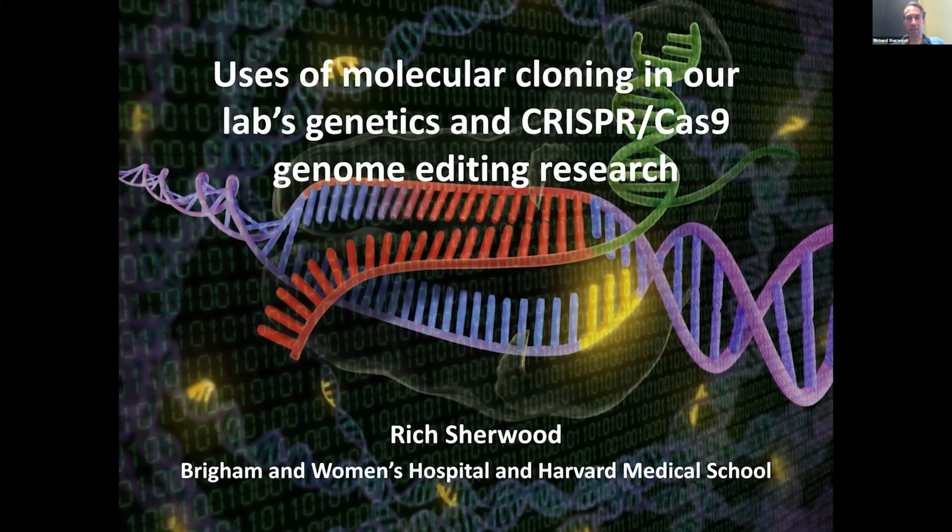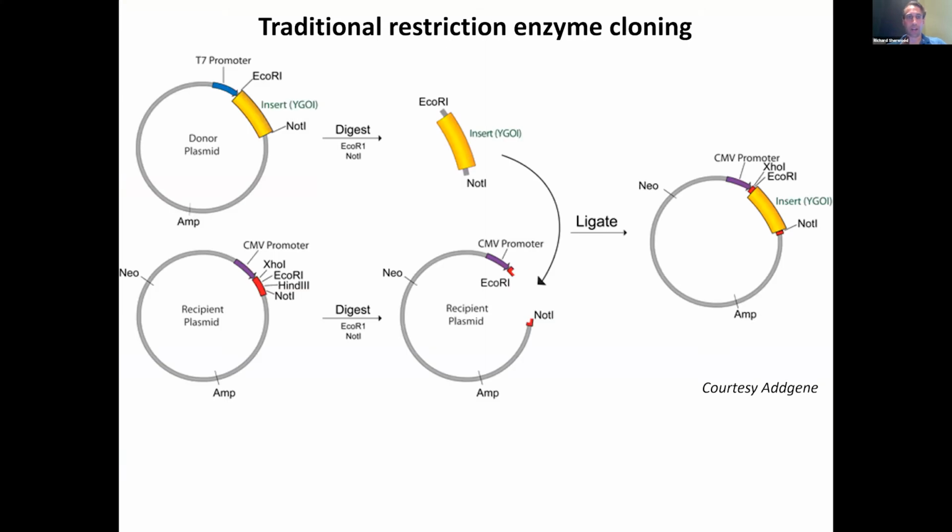So I guess in terms of the purview of my talk, I'm going to start with some basics of gene cloning, but very, very little on that, and then just go on to how our lab uses these techniques, because I think that's what the goal of today's talk is. So just starting out, I wanted to get everyone on the same page in terms of the basics of cloning.